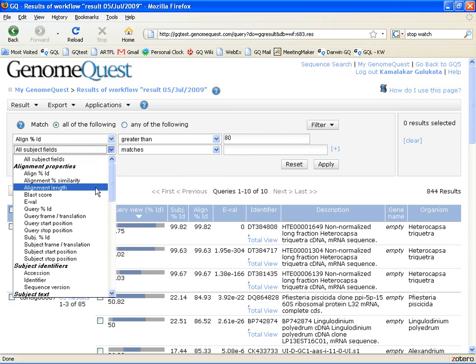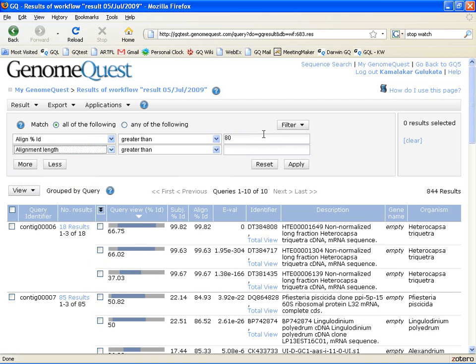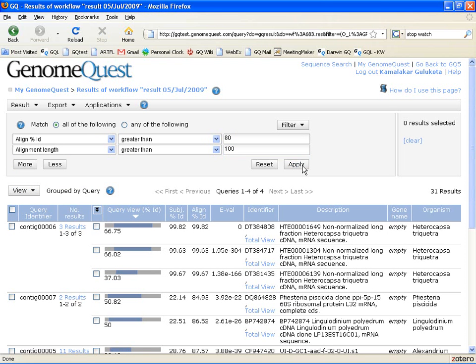I can simply apply those conditions and what I see is that there are only 31 results that satisfy these criteria and only four of my 10 queries actually match them.